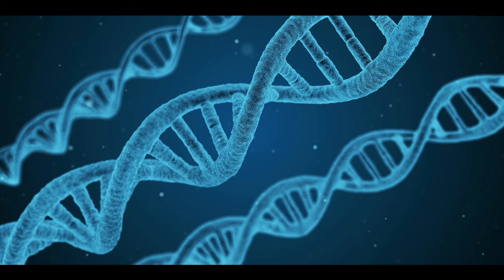But the BLAST search is one answer. If you really want to answer whether this is a species or part of a species complex, you have to do the phylogenetic tree like Sigrid showed, and you have to align all of your sequences and really do some statistical analyses to see how they match up. The phylogenetic tree is what is produced by SnapGene, is what you're using, Sigrid?